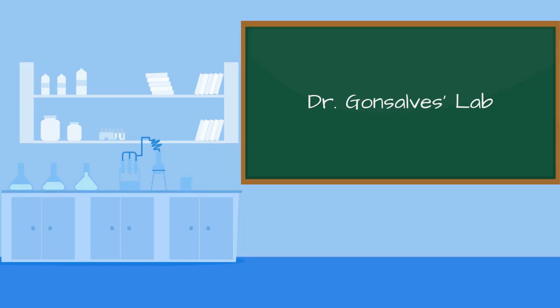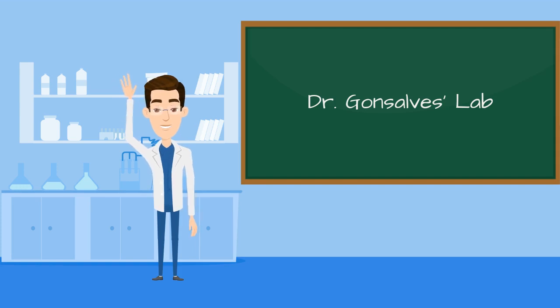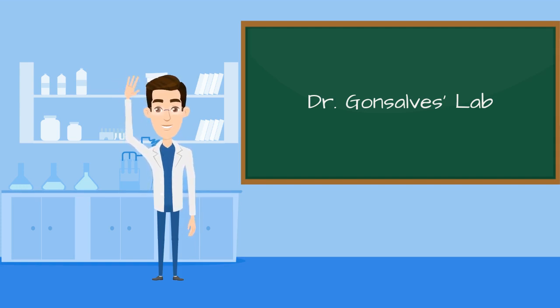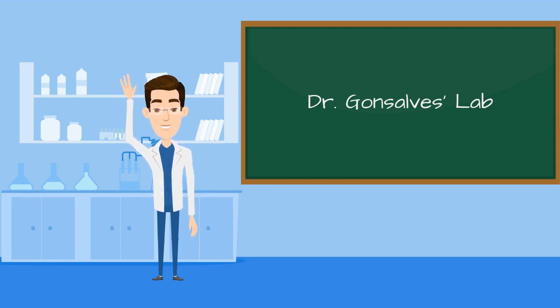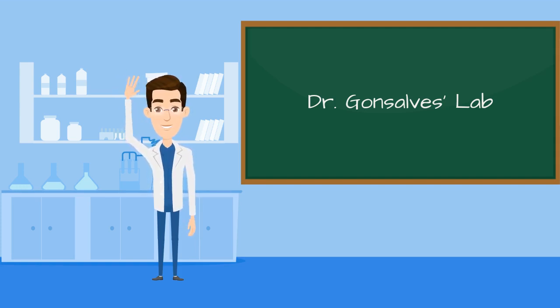Hey students, welcome to my organic chemistry lab. Today I have something very special to show you, IR spectroscopy.